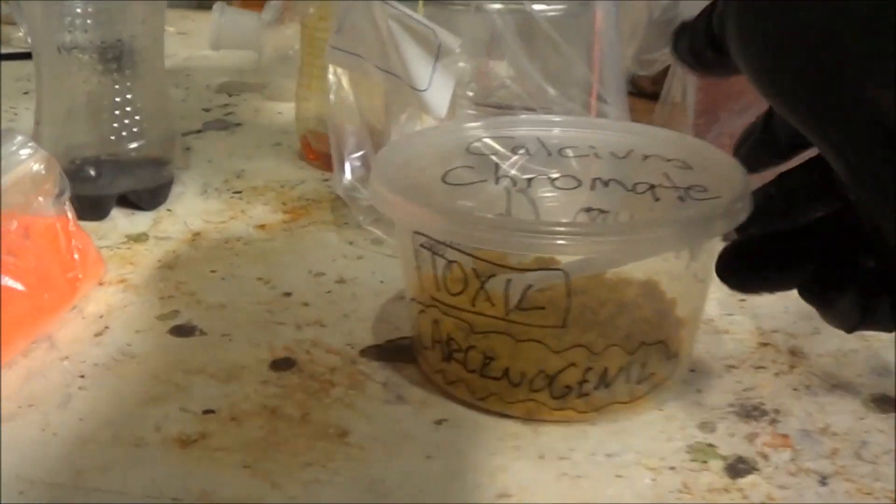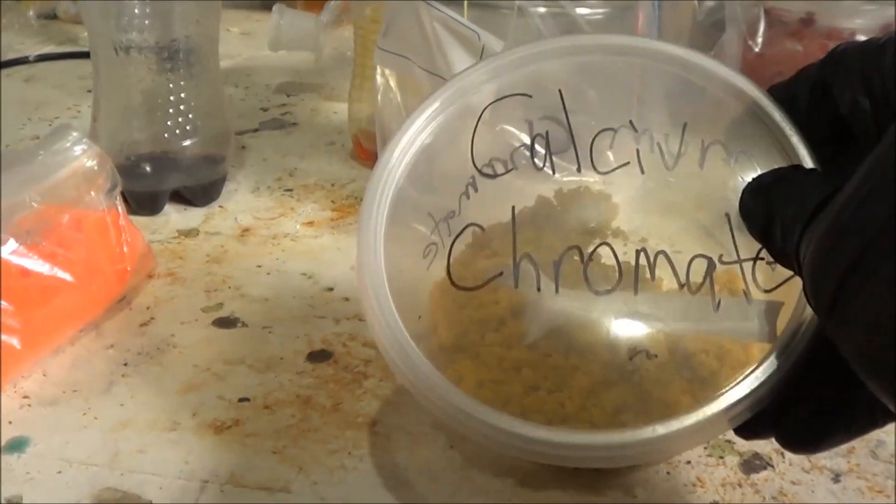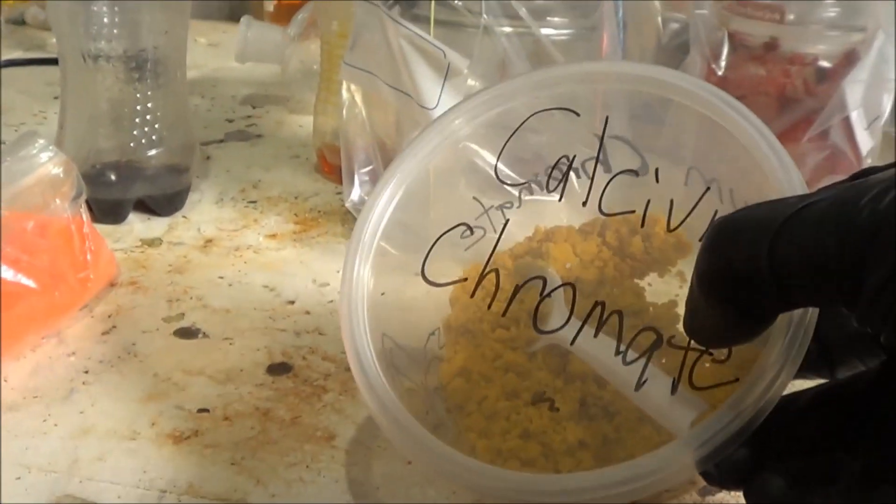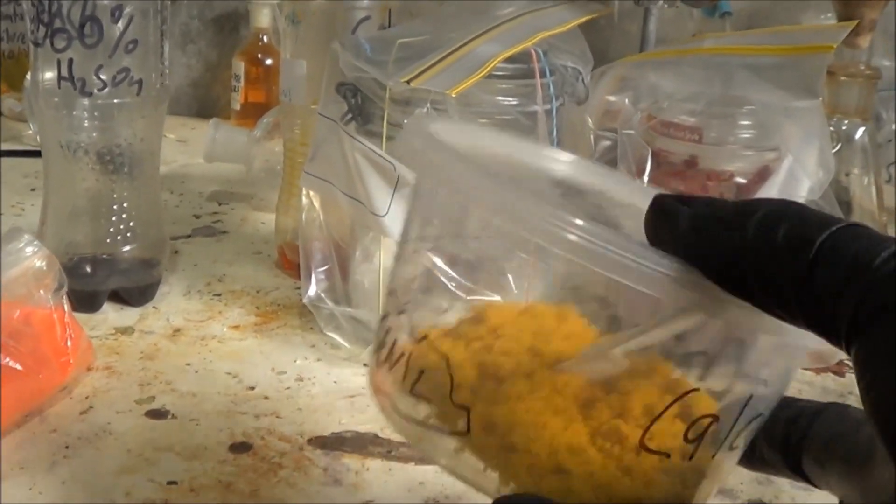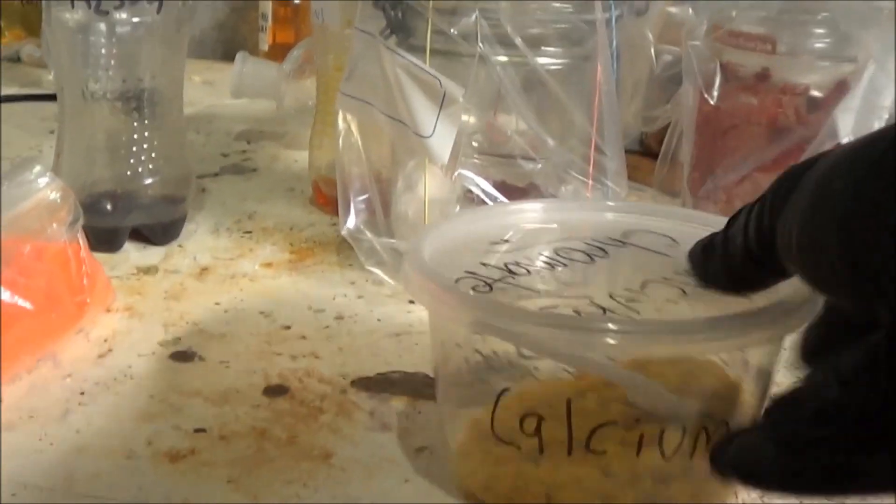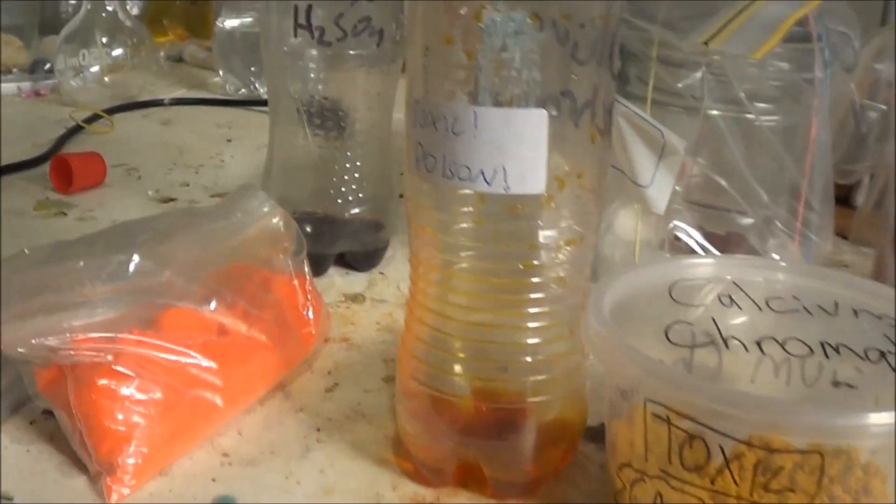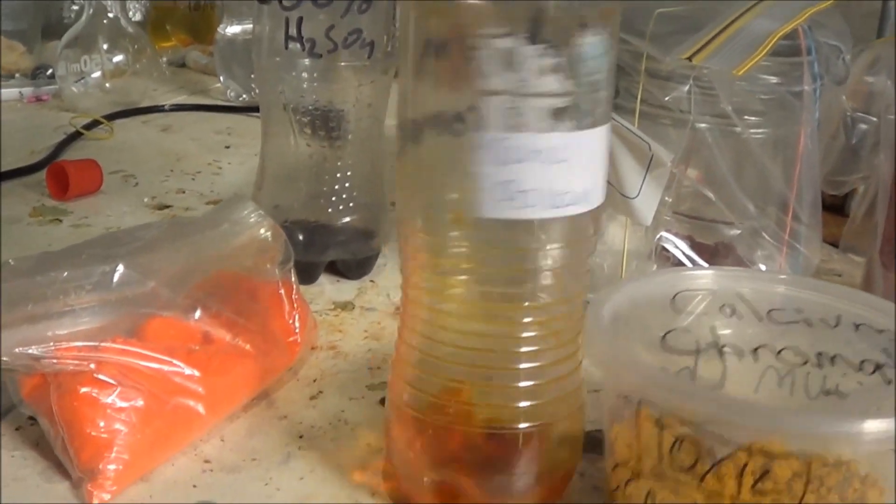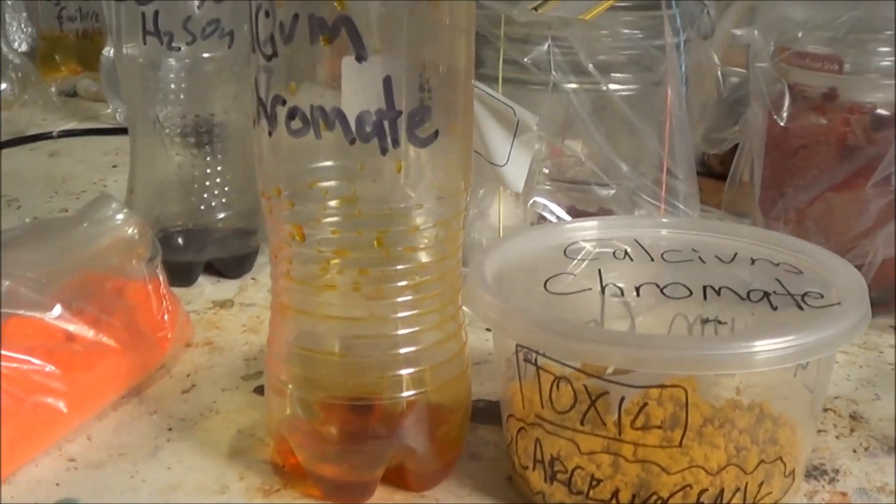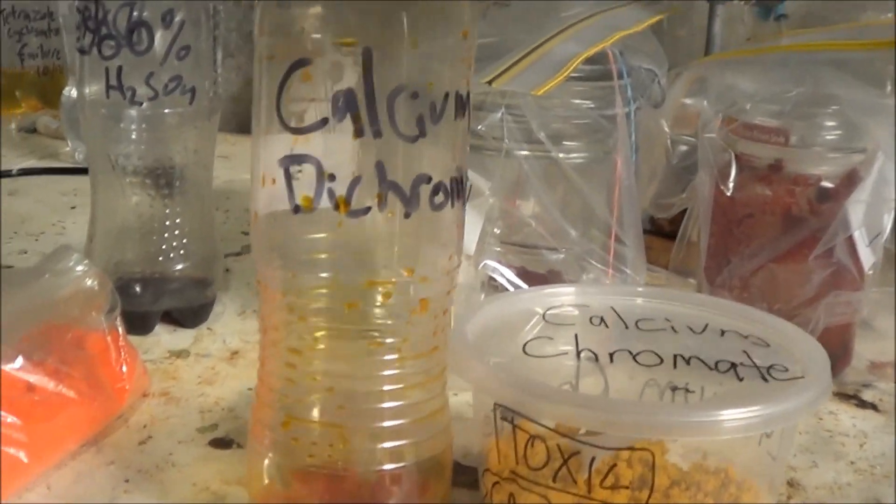So, where are we at now? This is what I have in my cupboard, which I believe, looking back at the footage, are the purified crystals. I don't know what happened to the lower grade. I think what happened is that I put them into a solution and I used this for trying to make several chromate and a few other things.